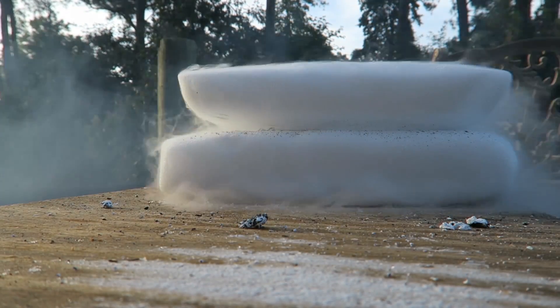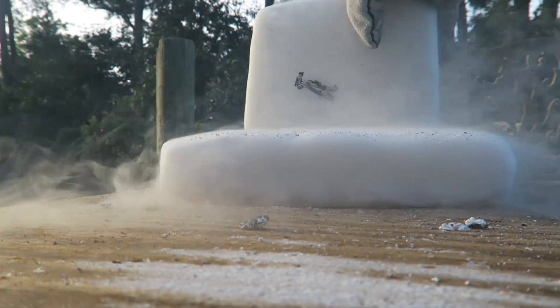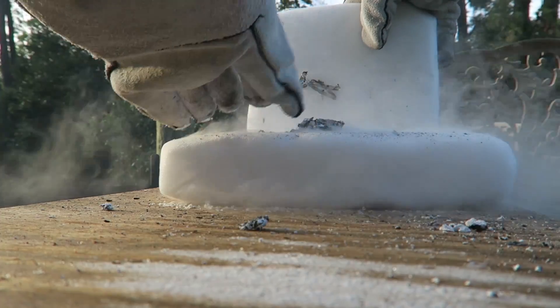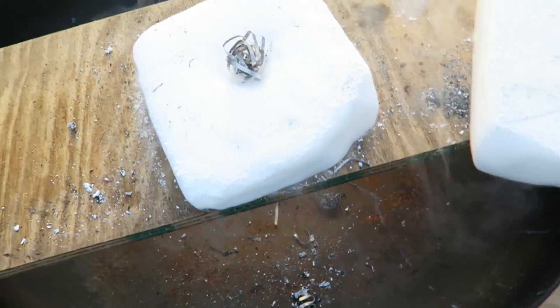Do you see that? It's burning so hard that the dry ice almost does not put it out — it takes a while. Pretty insane, huh? Alright guys, let's do it one more time.